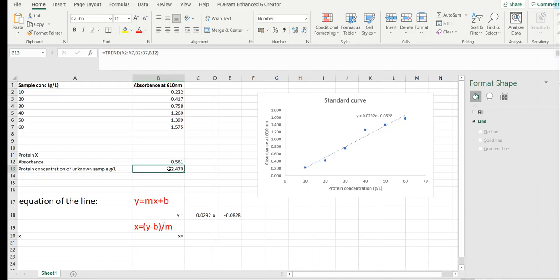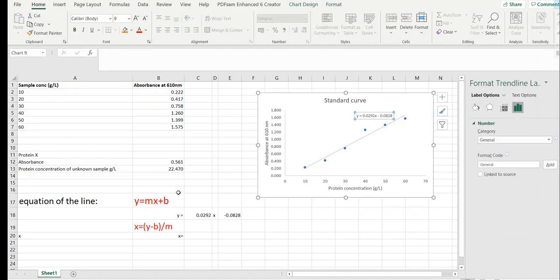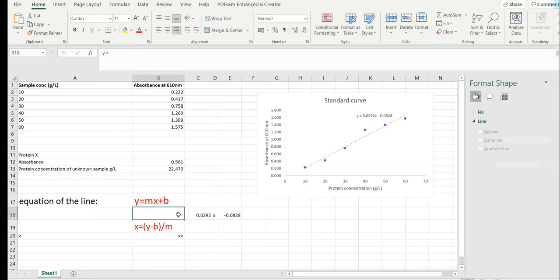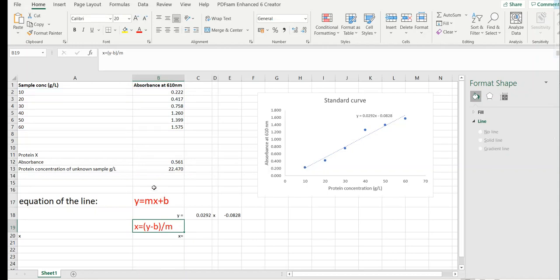Another way of calculating the protein concentration is through the equation of the line that we find here. So y is the absorbance value, m is the slope of the line, x is the protein concentration that we need to find, and b is the y-intercept. In order to find the protein concentration, we need to rearrange this equation in this way. So you put the y-intercept to the other side of the equation and you divide it by the slope.